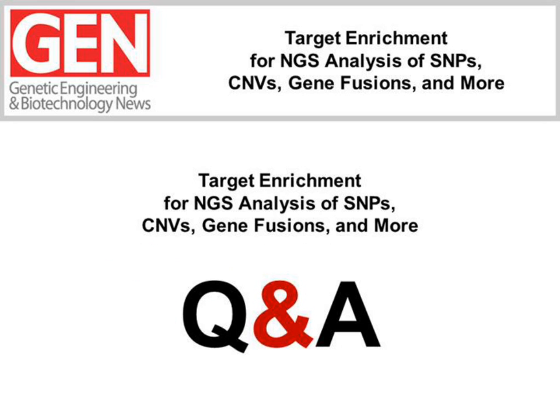Okay, another question is, which Illumina platform would you run this on? This is Steve. I'll take that. We've generated data on a range of different Illumina platforms, the MiSeq, the Genome Analyzer 2, as well as the HiSeq platform. So the chemistry in terms of our library construction workflow is compatible with the Illumina sequencing primers that are used across all of their platforms. So we don't believe there's a restriction there.